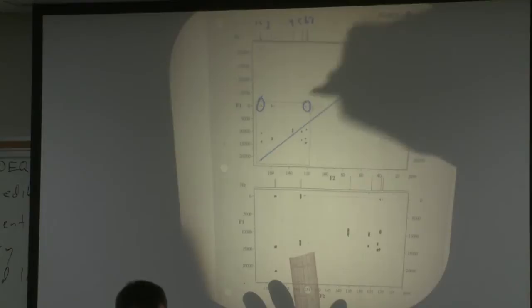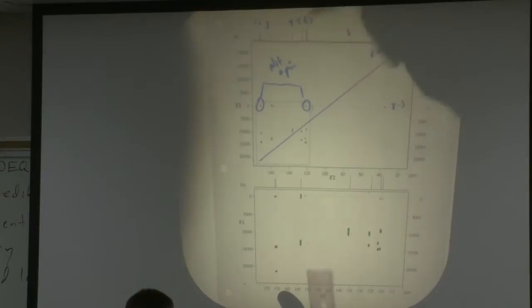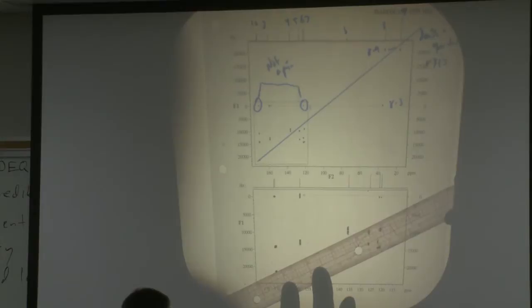It may be an artifact, it may be noise, but they're not a cross peak, because they're not spaced on that double quantum axis. So some type of artifact, but not a product of the double quantum axis. It also doesn't look like a split either.